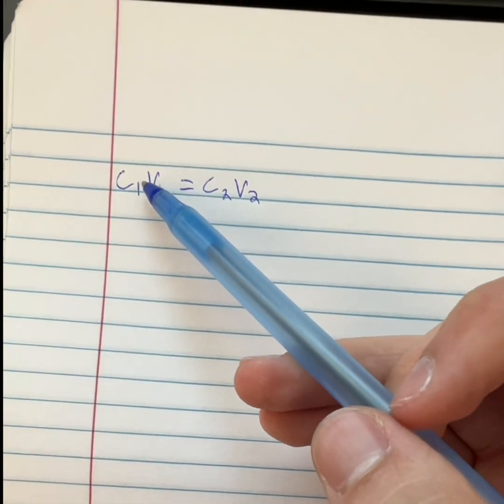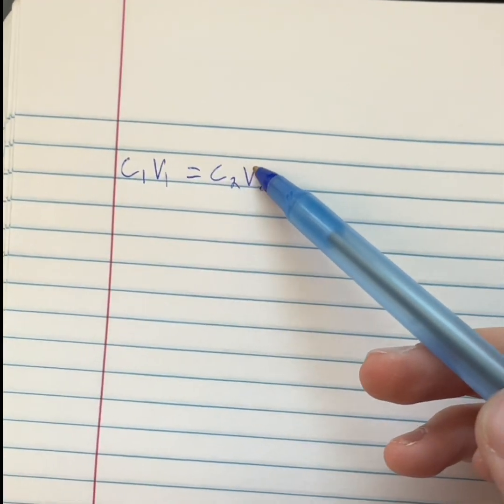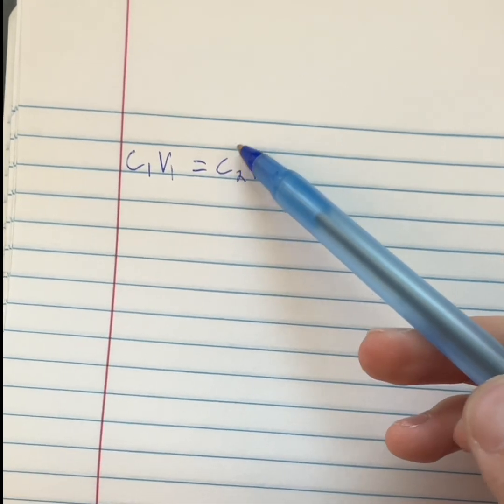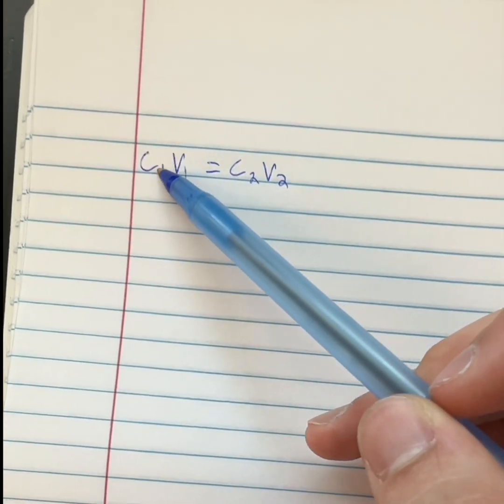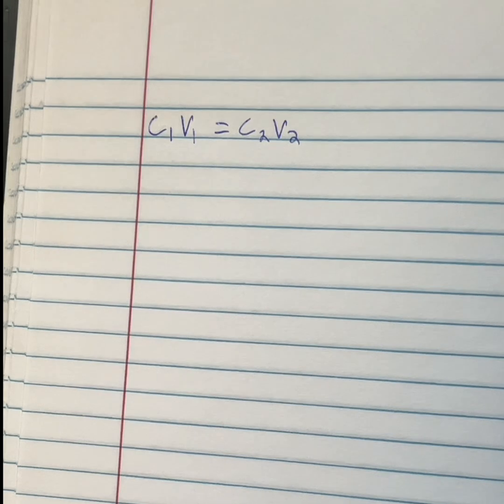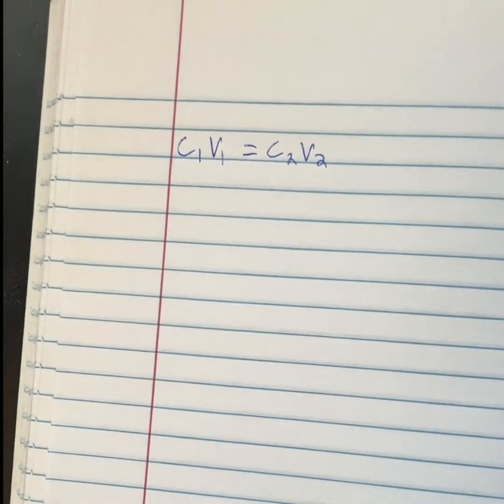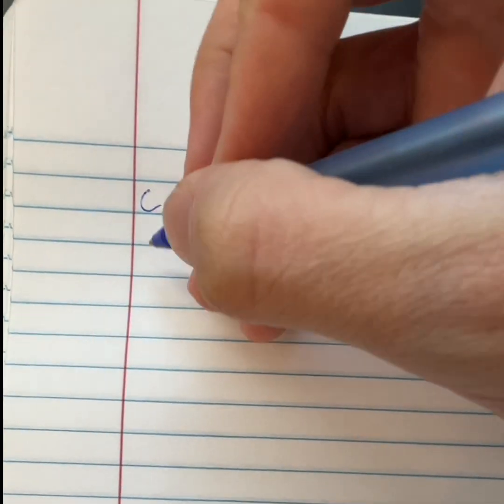If we know how much we're starting with in terms of concentration, and we know our target concentration and our target volume, then we can solve for however much of the initial volume we are going to add to the RPMI to get our desired concentration. It's a very, very simple equation.